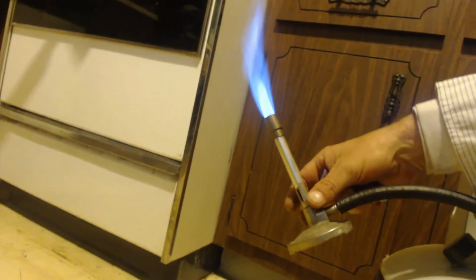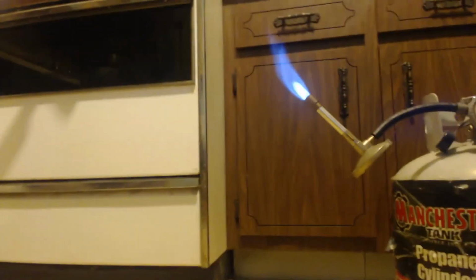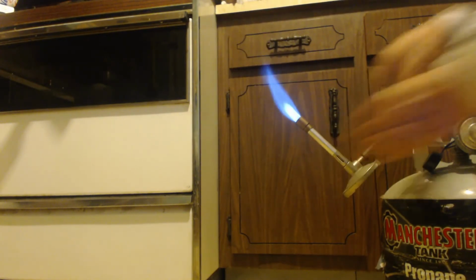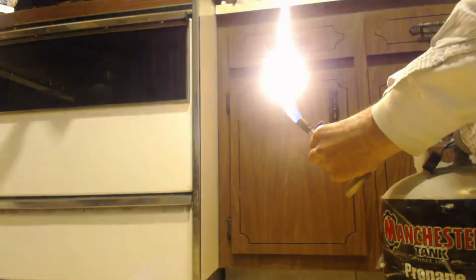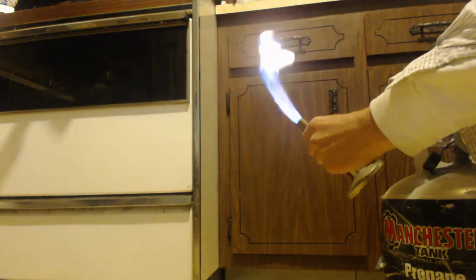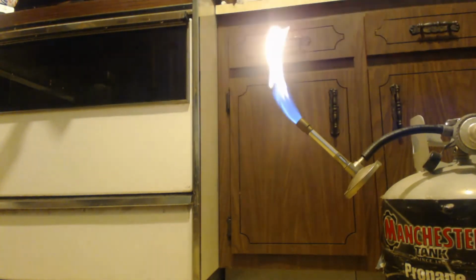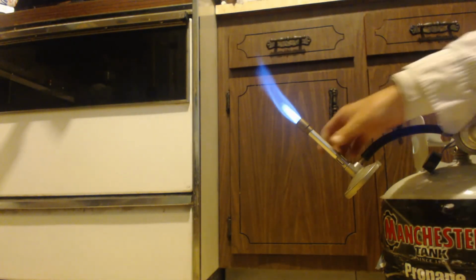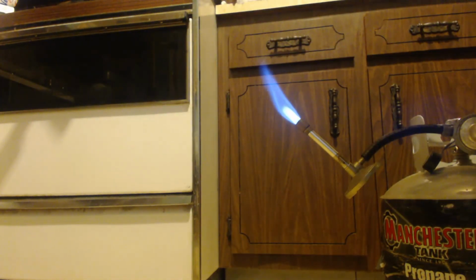Now if you turn it down to the orange flame, I need two hands to do it though, but there we go. It's doing the opposite here. There. Got my cool flame. Got my blue flame, hot flame. Anyways, just want to show you that.